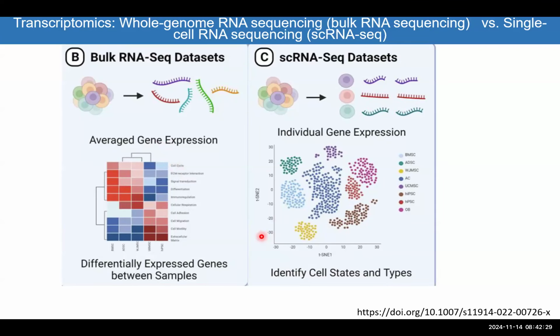You can get all these correlations, and you can get the single gene if it's up or down regulated. You can clearly get those numbers. But now technology is advancing, and we are at the level where we can do RNA sequencing on single cells. So instead of taking the tissue altogether and comparing it to another tissue, which is not presented in this image, like again, healthy versus diseased, then within this particular tissue, you're gonna dissociate it first into single cell suspensions.